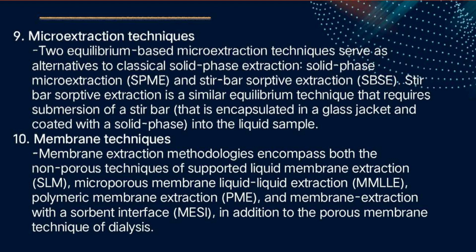Membrane technique. Membrane extraction methodologies encompass both the non-porous techniques of supported liquid membrane extraction (SLM), microporous membrane liquid-liquid extraction (MMLLE), polymeric membrane extraction (PME), and membrane extraction with a sorbent interface (MESI), in addition to the porous membrane technique of dialysis.